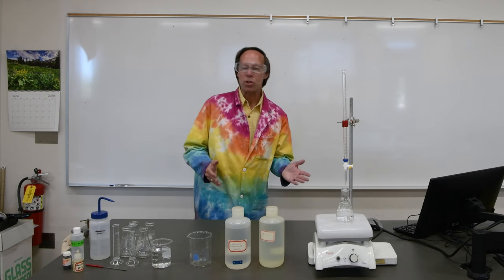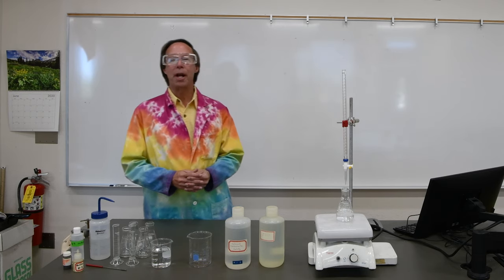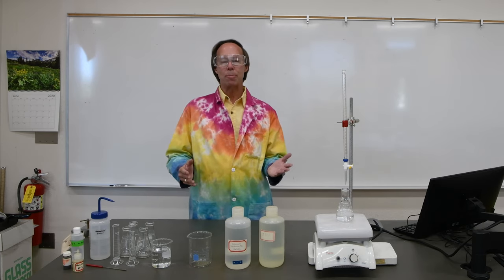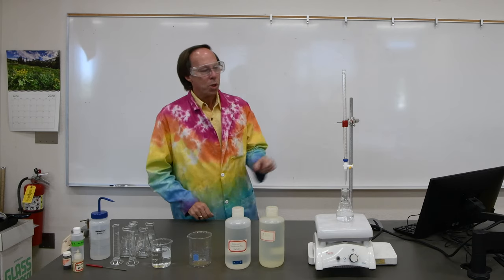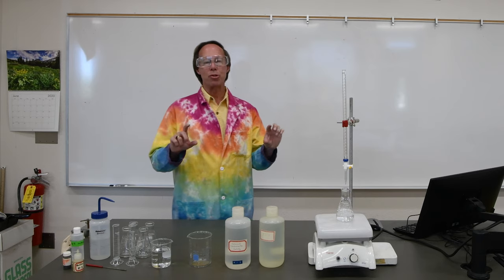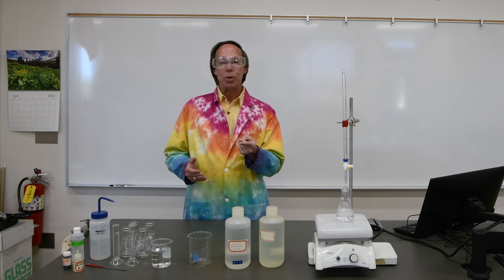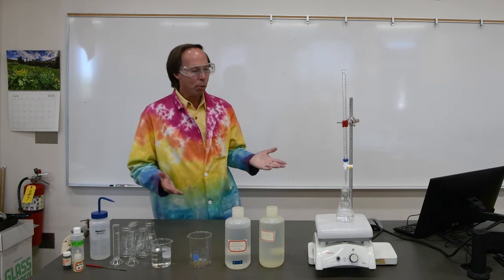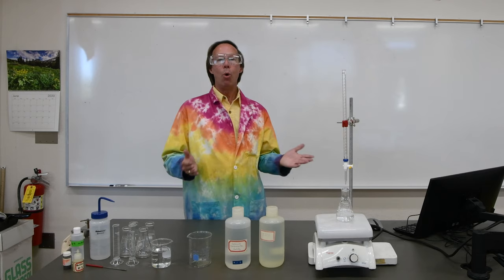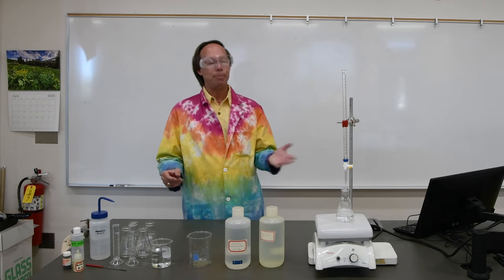So I'm just going to give you a basic overview now, then you can watch that video and we'll head on into the lab and get to work. But essentially it works this way. You have two substances, A and B. We know how much the concentration of A is, but we don't know the concentration of B. We do, however, know what the stoichiometry is of the reaction. So for example, if it's a one-to-one reaction, we know that for every mole of unknown B, we would need a mole of A.